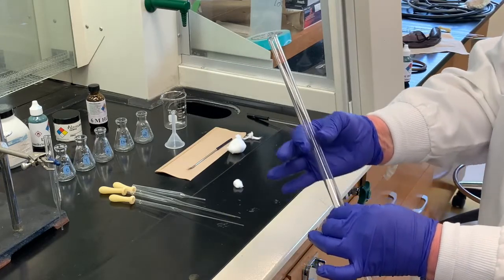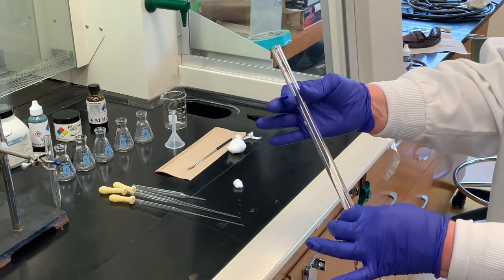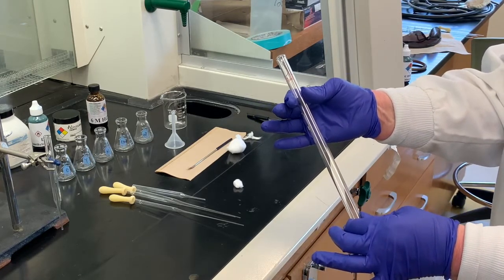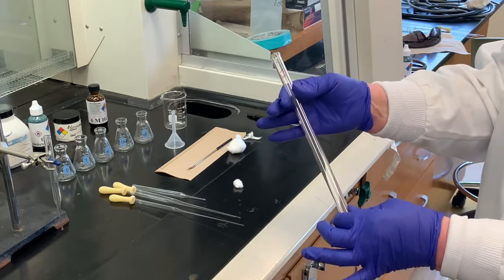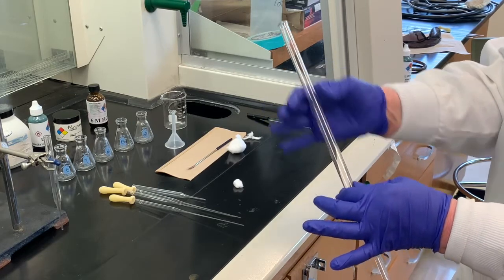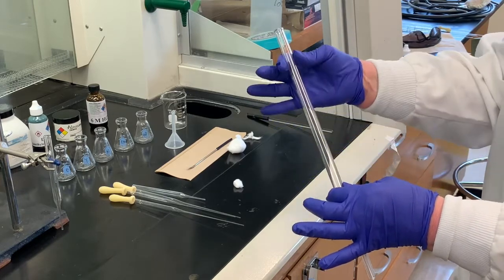Then we would fill up our column with whatever adsorbent stationary phase. And there's different ones you can use. Traditionally in most chemistry labs, you would use alumina, which is aluminum oxide, or you can use silicon dioxide, or really silicic acid.